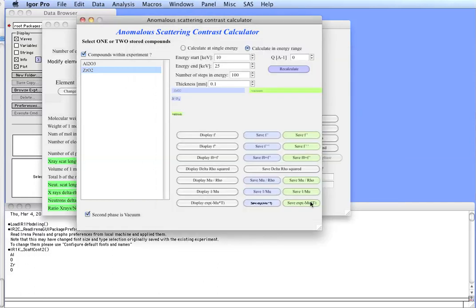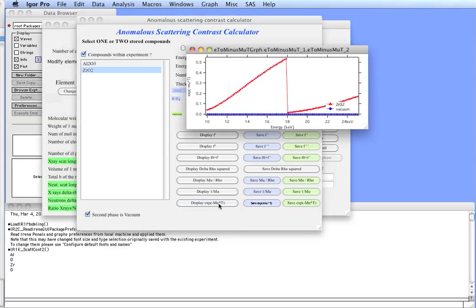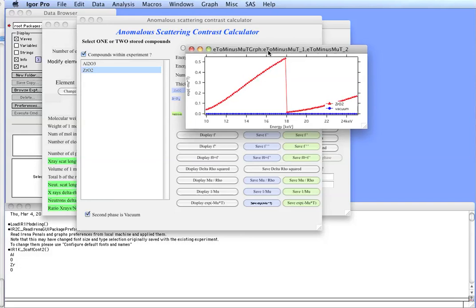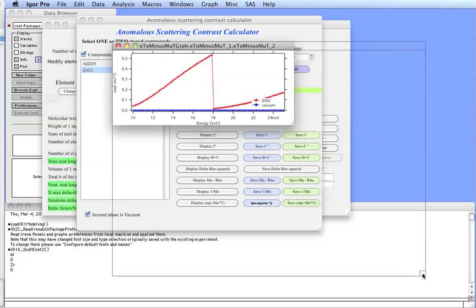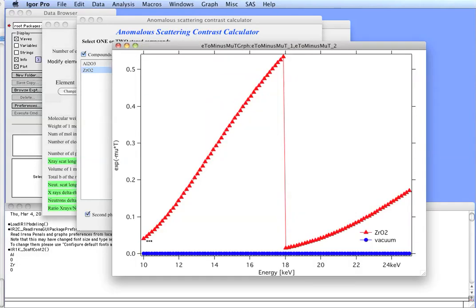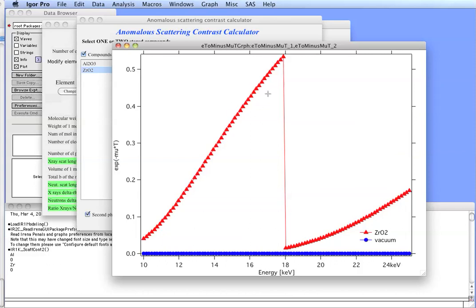The other thing which you may find useful is, I have a 100 micron thick sample, and I need to be able to get through it, what is my best energy. And again, you can display e to the minus mu T is the transmission, so you can do this. And if you look on this graph here, you can see that at 10 kV, you probably can get about 5% transmission through your sample. As the energy increases, you are, of course, getting more and more through your sample, up to about 55% just before the edge. Then, when you go above the edge, the transmission drops down to basically a few percent and starts increasing again, and as you go up at 25 kV, you are still only about 15% transmission. So, in this specific case, if you had a choice, you would have to go and do the experiment somewhere between, let's say, 14 or 15 kV and 18 kV, where you have the highest transmission of the sample.